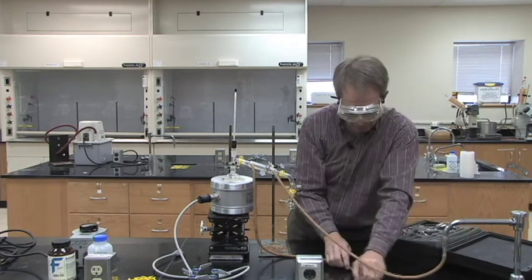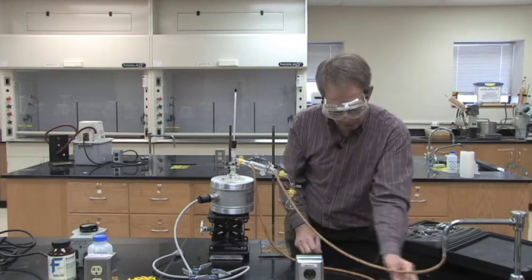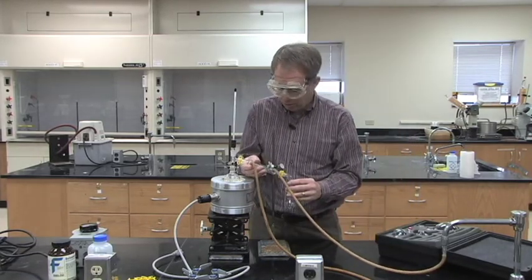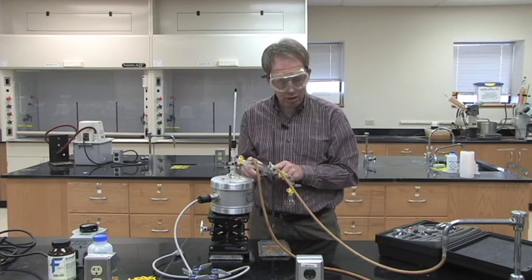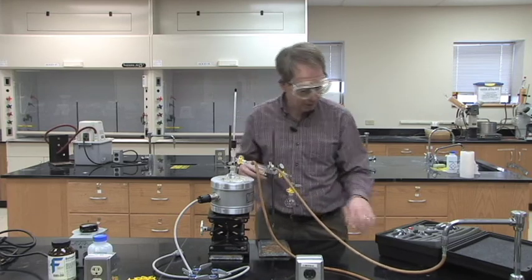And then the upper end of the condenser will go into the drain of the sink. That way as you're going along, you will fill the condenser with water and then the water will run out to the drain.